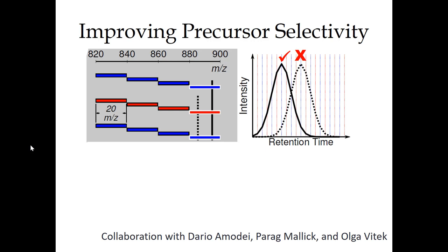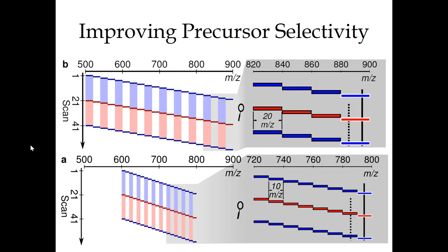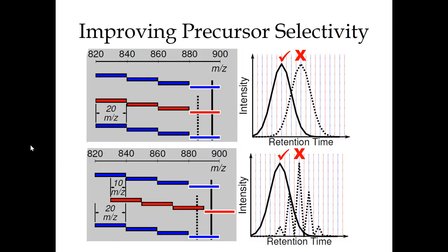So we've already said we can't really jump down to doing 10 m/z wide isolation windows, right? So imagine this case, though, with the 20 m/z windows that I've talked about a lot, where you have the precursor of interest being co-fragmented with another precursor. It's just like in the slides that I showed. If you were acquiring at 10 m/z, you might resolve these two precursors, right? So they would be in different isolation windows and they wouldn't cause problems for you. But I've already kind of detailed why we can't drop down to 10 m/z or even narrower isolation. So what can we do?